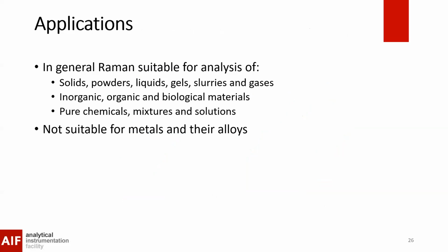All right, the next part is a few very interesting and exciting examples, covering the pharmaceutical industry, carbon materials, and jewelry authentication.